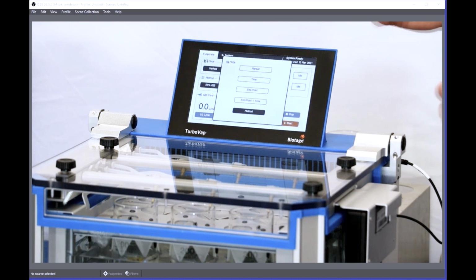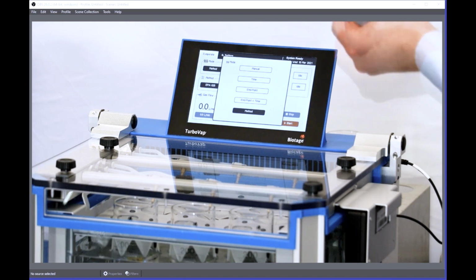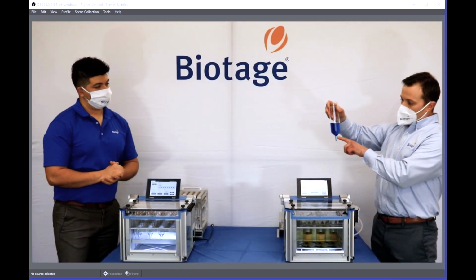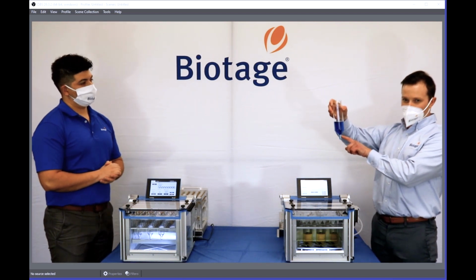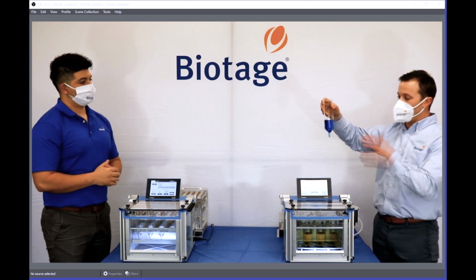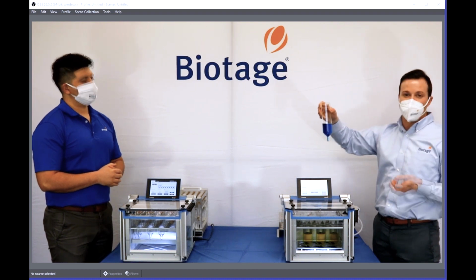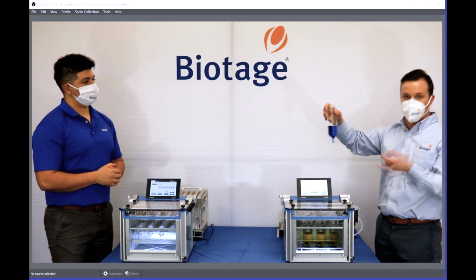So if you wish to go down in your tube to a volume of 1 mil, you could actually add some time at the end of your concentration protocol. So once it reaches the 1 mil point, you add a minute or 2 minutes, and it'll bring it just past that. So you can actually have more room if you're adding internal standards or whatever you're adding to your final extract.